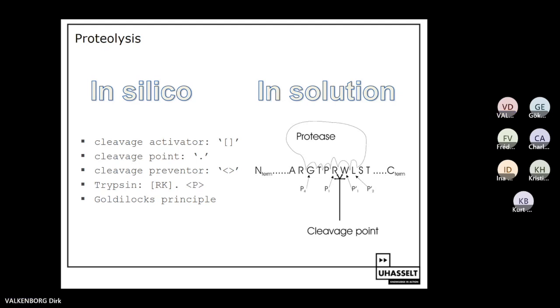So what trypsin does in real life: typically we add trypsin to our protein sample and let it rest overnight at 37 degrees Celsius and let it do its job. Trypsin is not perfect and will once in a while miss a cleavage, and that happens. So we need to accommodate that behavior also in the computer.